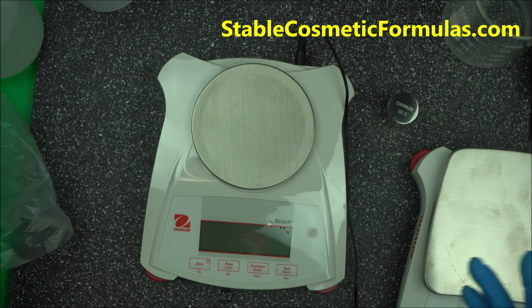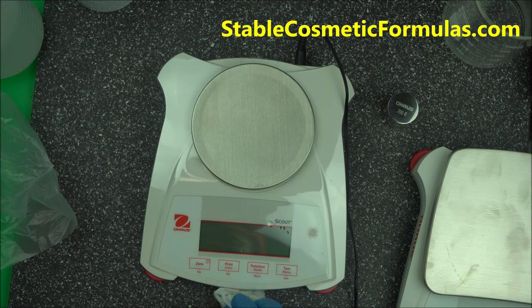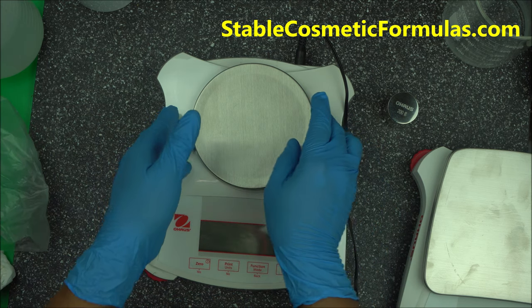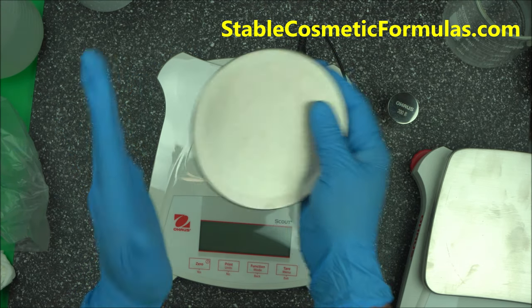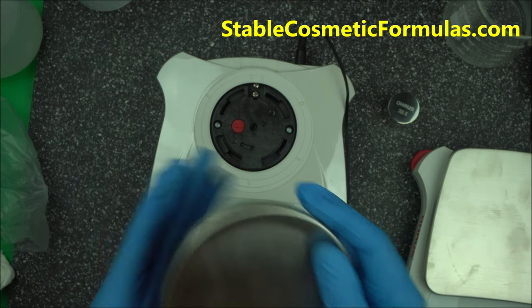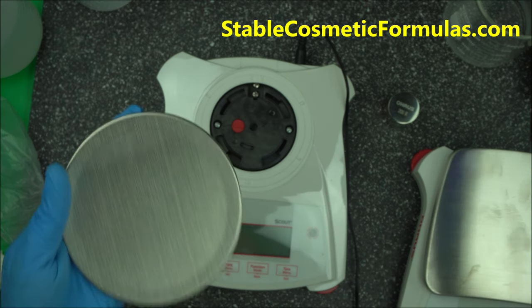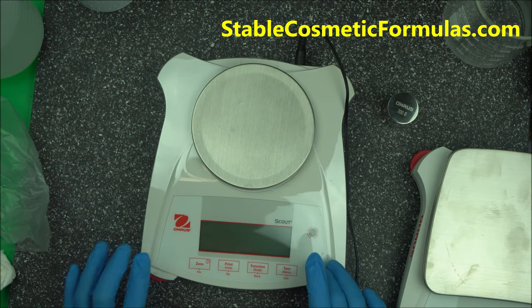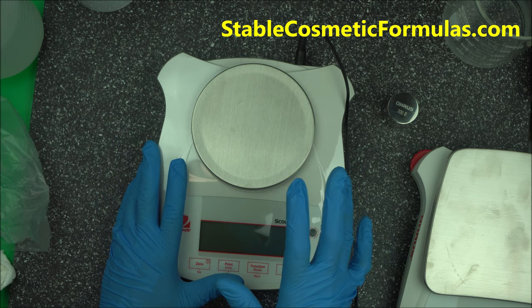To clean the scale, do not use acid or spray isopropyl alcohol on it — that will destroy it. Just use regular liquid castile soap. Take the pan out, wash it with liquid castile soap, and rinse with distilled water. Do not use any harsh chemicals.